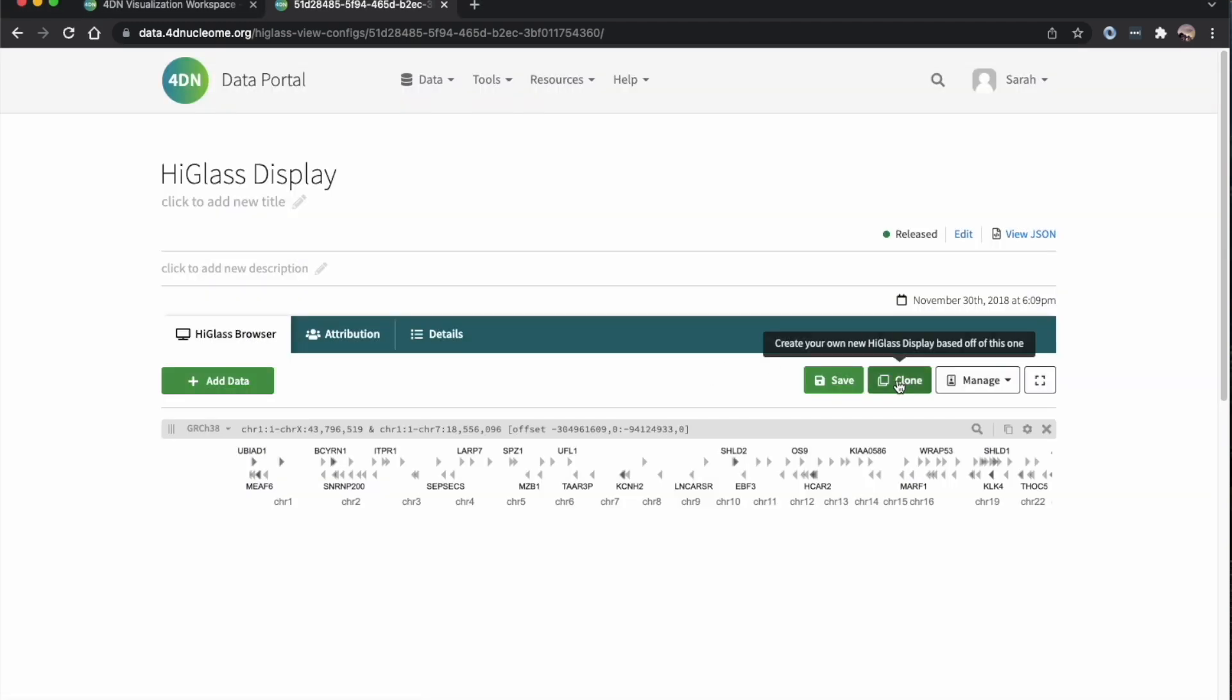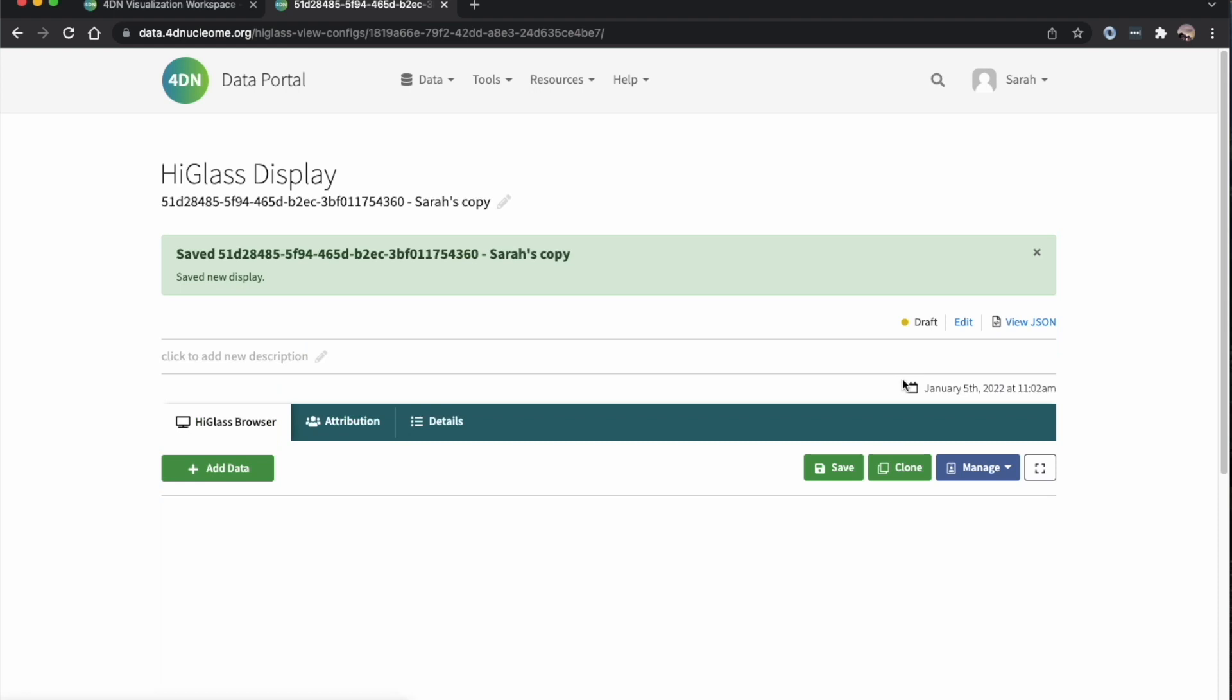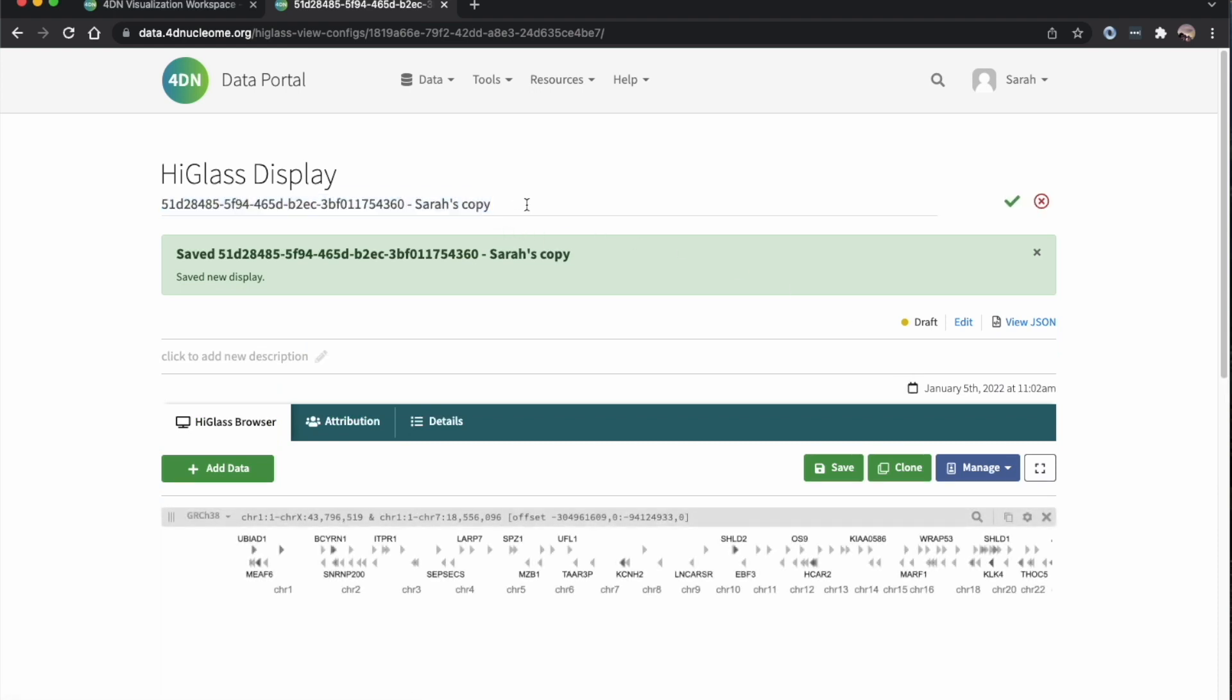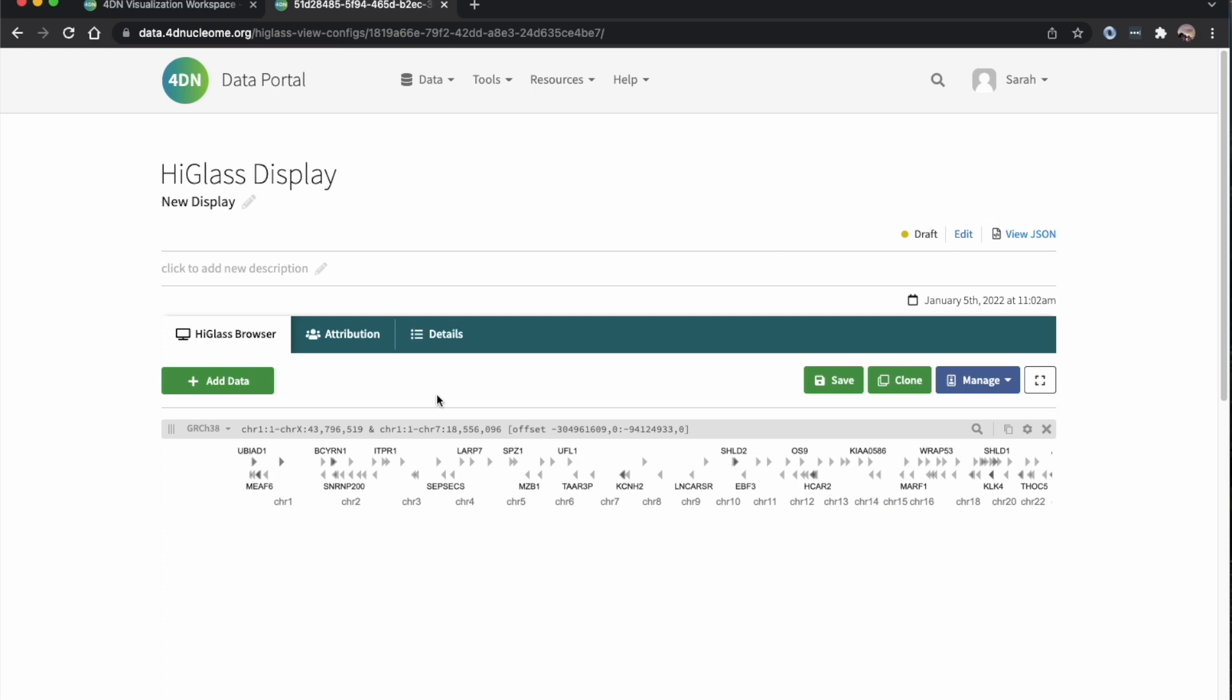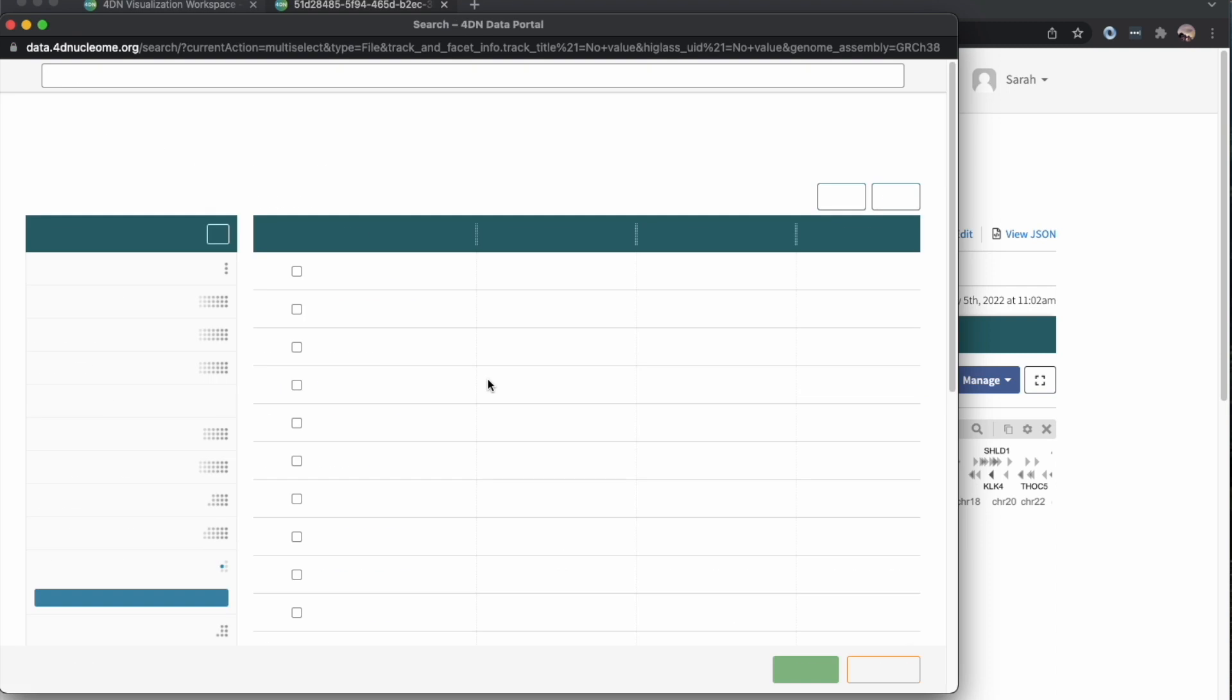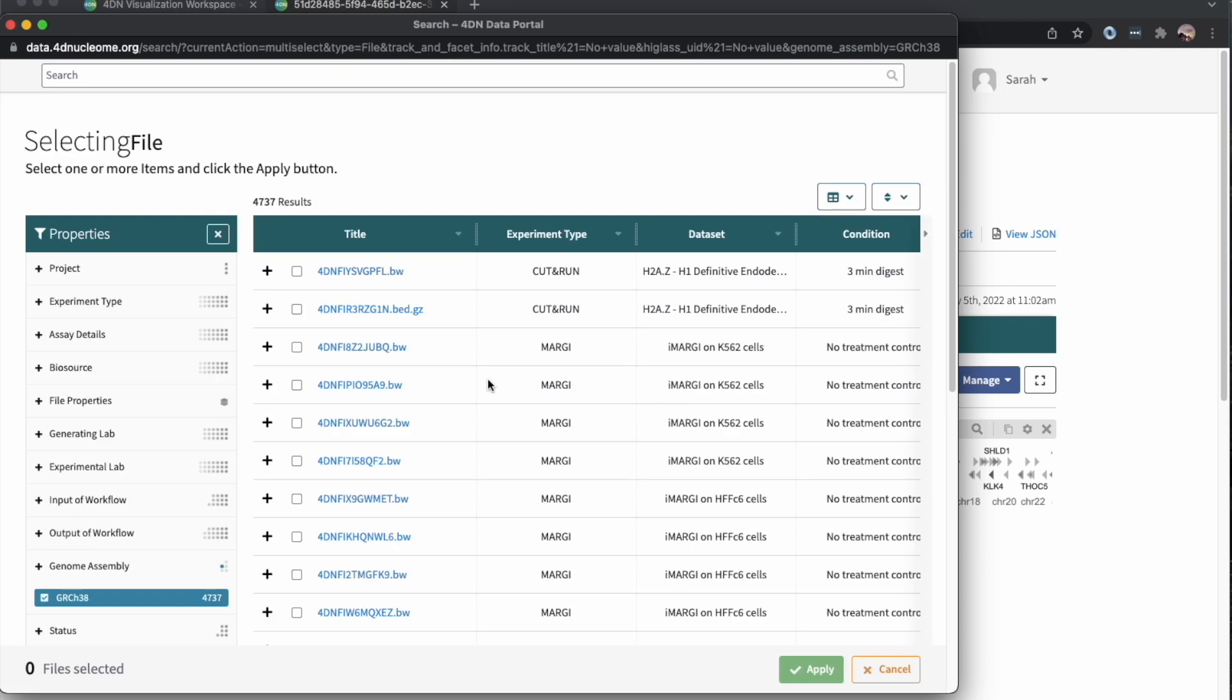I'm first going to clone the display so that I have my own copy, and I can name it if I'd like. Now I'm going to click on the add data button, and there'll be a pop-up window that allows us to use the search and filtering capabilities.